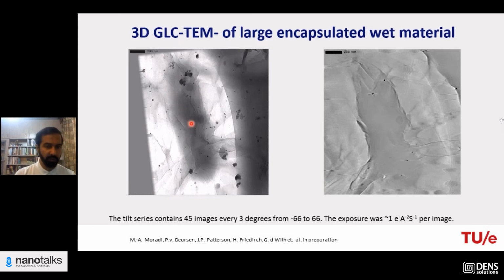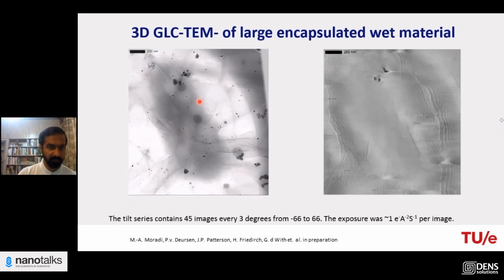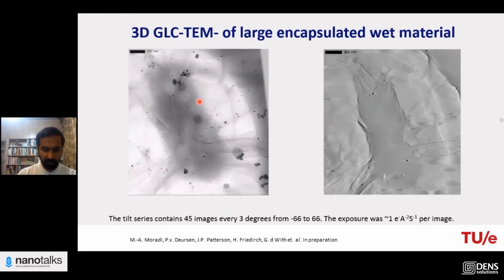While you see this big amount of water in 3D, you can actually see some shortcomings of the graphene work, where you get a lot of wrinkles, and the water bucket is not in an ordered form. And on the left, actually, you can see the lightnings of the electrons that touch the graphene and salt in our system.